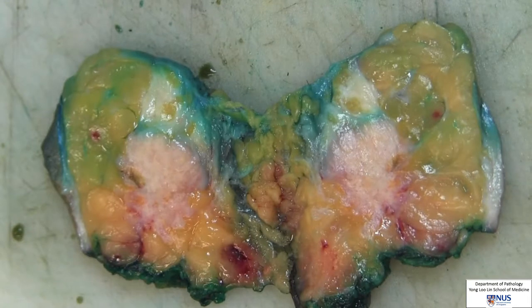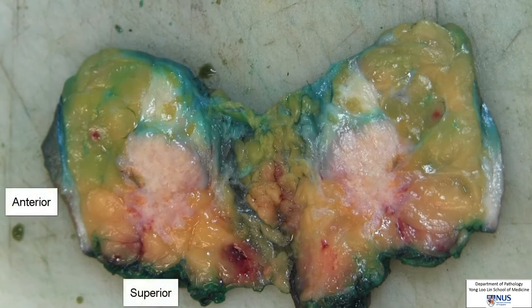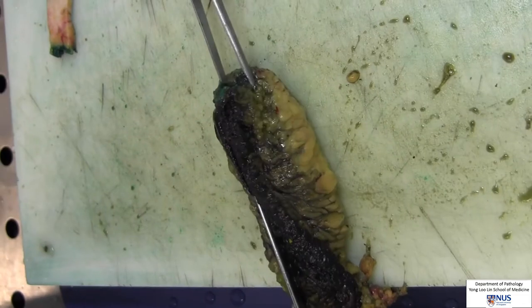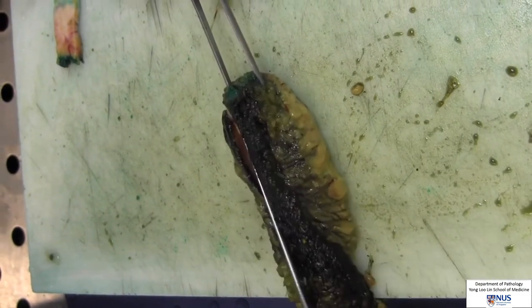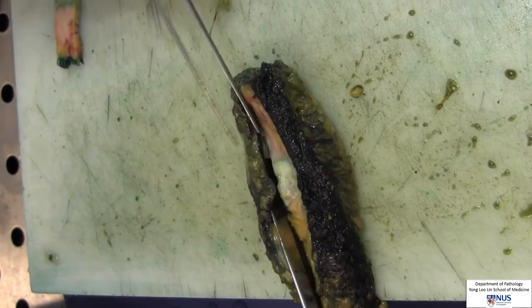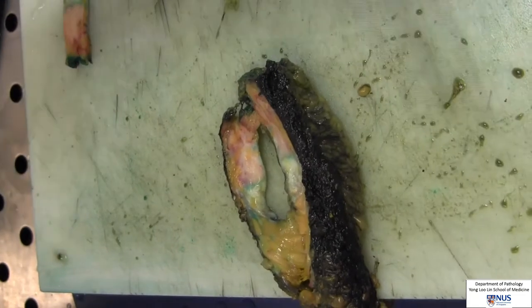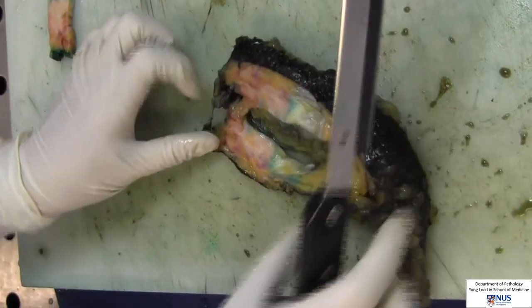We will examine the slice of breast with the tumour closest to the margins. To orientate, the anterior margin is covered by skin, the superior margin is inked green, and the inferior margin is inked yellow. We will take sections of the tumour with adjacent normal breast tissue at the superior and posterior margins. This is an example of how the tumour will be sampled with the posterior margin, and the same process will be repeated for the superior margin.